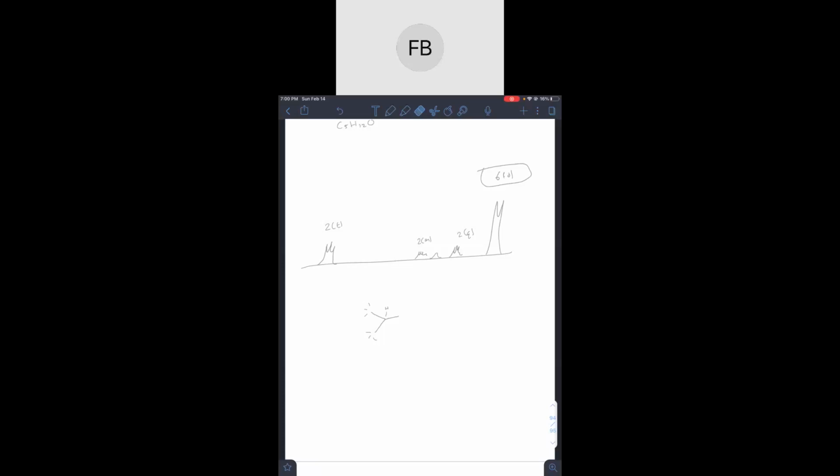Now move on to a different peak. What I would do, like what I just showed with JD, is follow through the peaks I chose. This is a 6 doublet that I just drew. Now I will look at the one adjacent to it and follow this one through. This is a 1H, and this one must be a multiplet, right? Because it has how many adjacent hydrogens? It has so many, right?